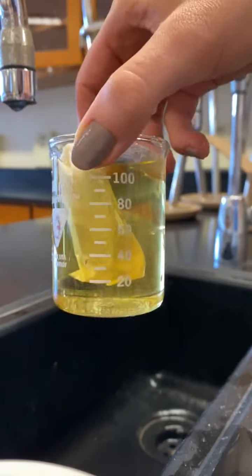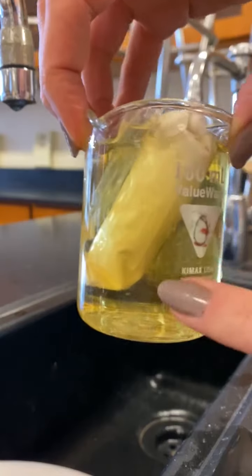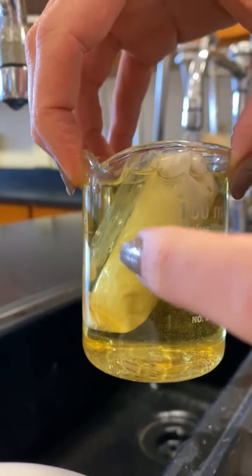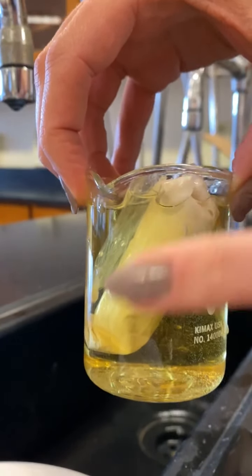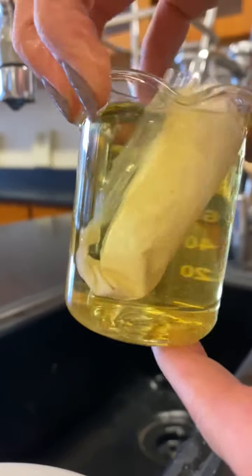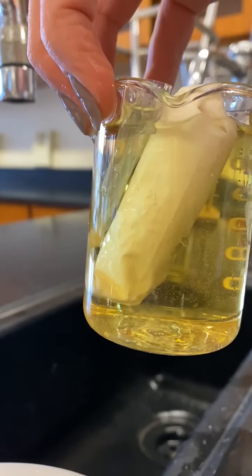Now would be the time to make our hypothesis. What do you think is going to happen? Is the iodine going to change color? Is the flour inside the tubing going to change color? That means: is the iodine going to come into the tubing, or is the flour going to flow out and change the color in the beaker? You have to think about what kind of molecule would be able to diffuse in or out of that tubing.